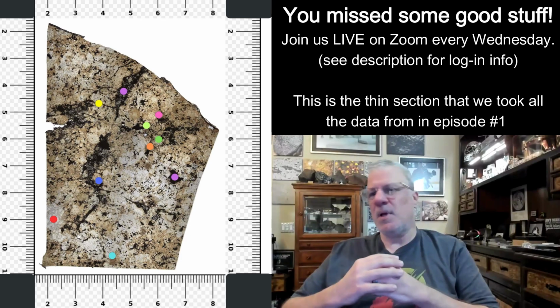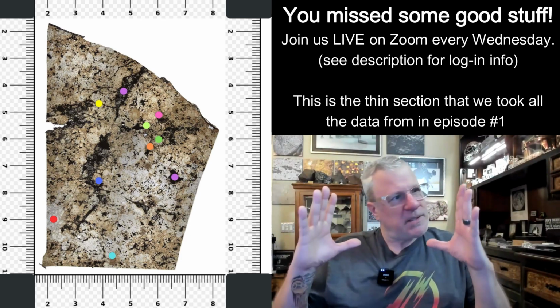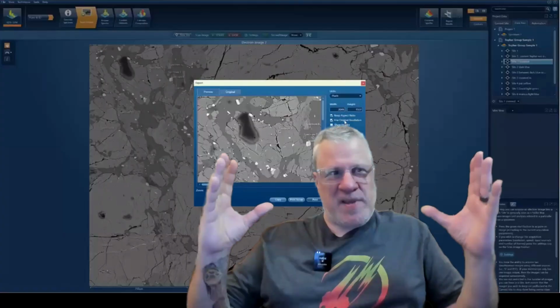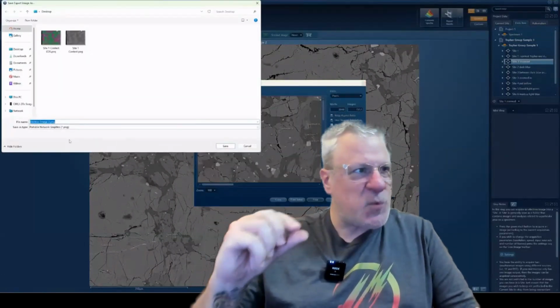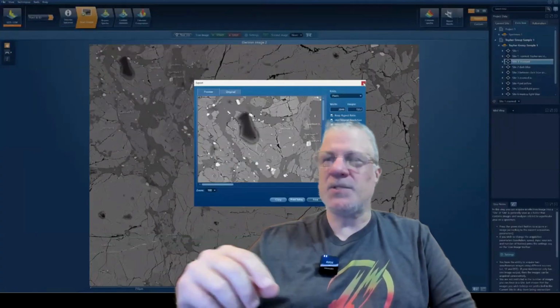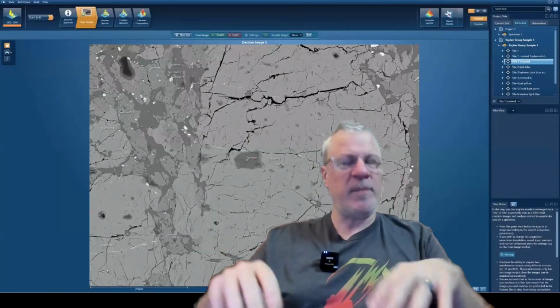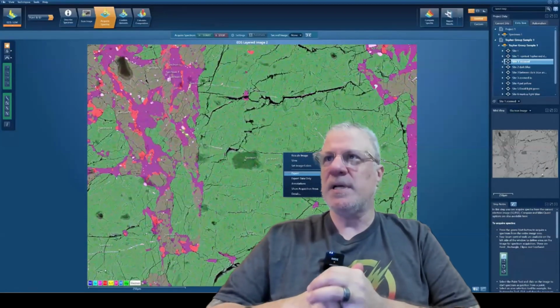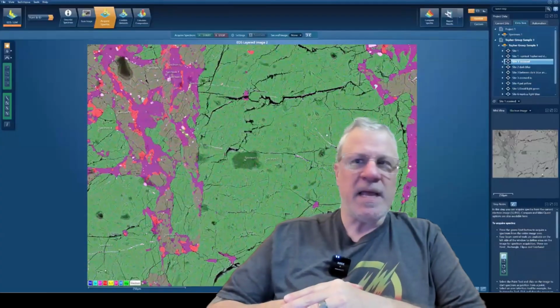Yeah, we helped. What's amazing is these thin sections look small until you keep zooming in and zooming in, and the actual area that you're scanning, those squares that we were drawing, I was amazed at how small they are. So we wanted, as a crew, to pick exactly where we wanted to sample from. So we just put big old thumbprints of different blotches of color to help us navigate somewhere on the slide to start with. But yeah, it was pretty crazy.